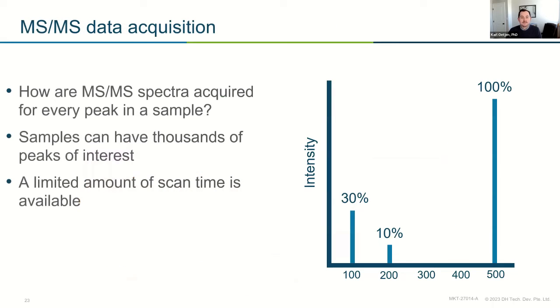So how do I do that? And this is where things get kind of cool, right? Because we know there's going to be so many compounds present in this sample. How could I possibly collect MS data on these if I don't know what I'm looking for, the retention time, all these sort of variables? What kind of technique can I use to acquire that data?